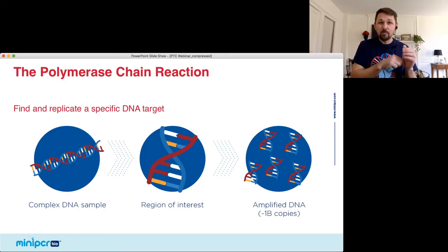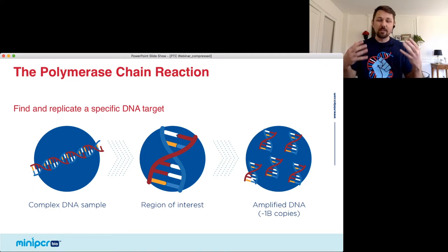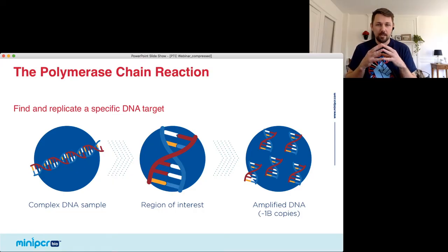that tube. Now, I just ate a banana with peanut butter on it, so I guarantee there's peanut butter DNA, or peanut DNA. There's banana DNA in there. There's my DNA in there. There's bacterial DNA in there because there's bacteria that's living in my mouth. So we have in that tube that's still heating in the machine here, we have a really complex DNA sample.